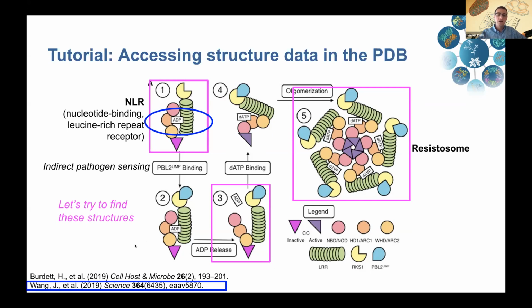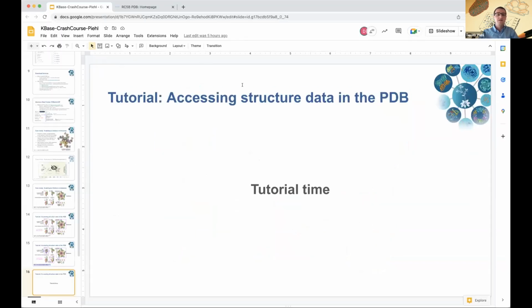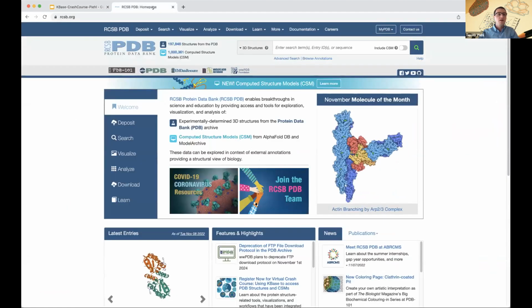We can also use the fact that these structures were determined by electron microscopy, which I found out by reading this paper here, and as you would be able to as well. So let's go ahead and try to do this. I'm going to exit out of my presentation mode, and I'm going to go to rcsb.org.